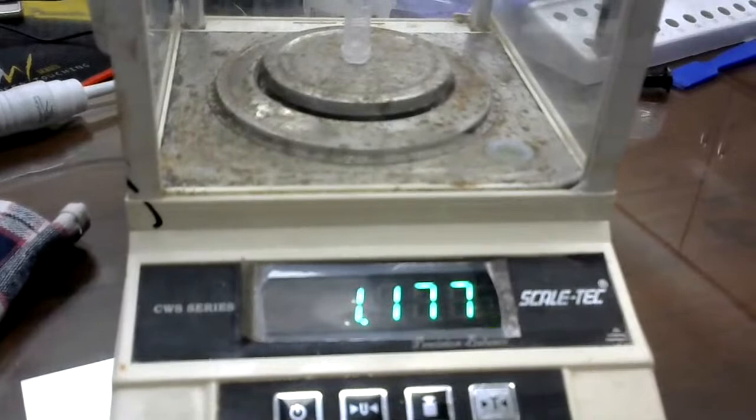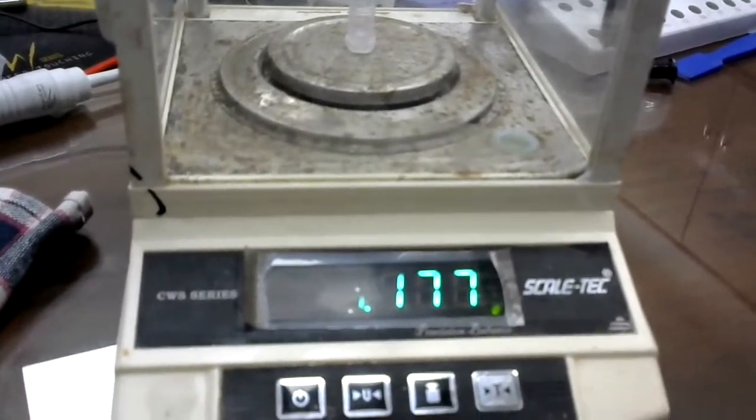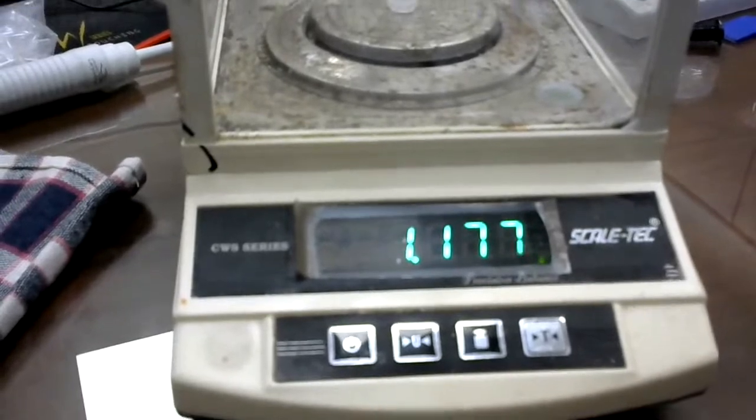1.177 gram. So that is the weight of this Eppendorf tube.